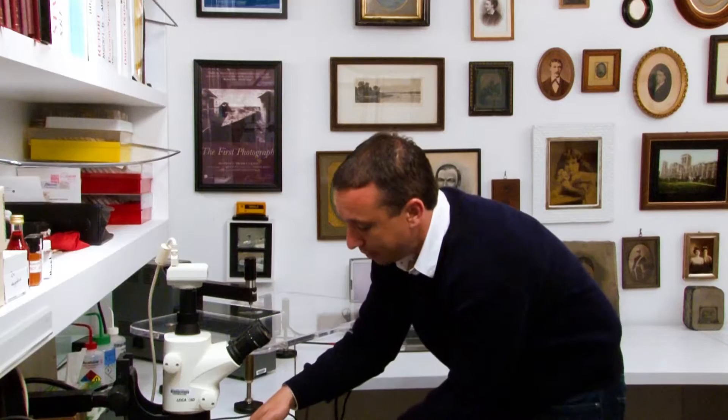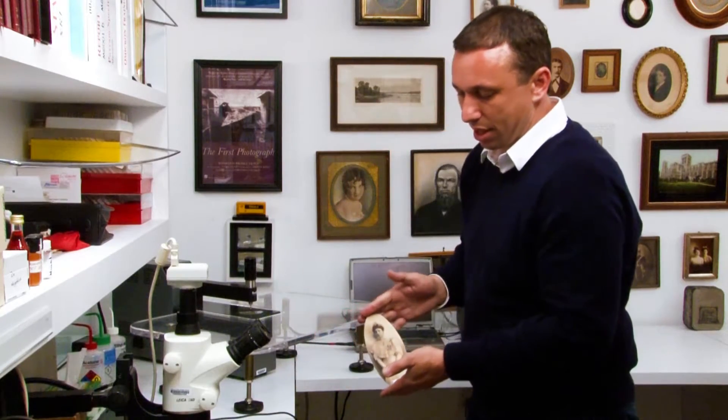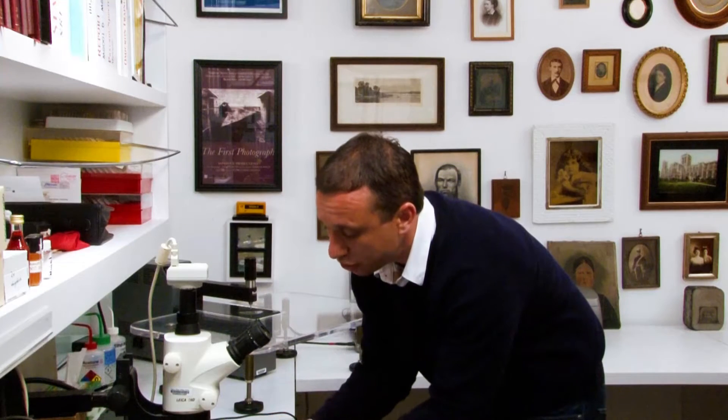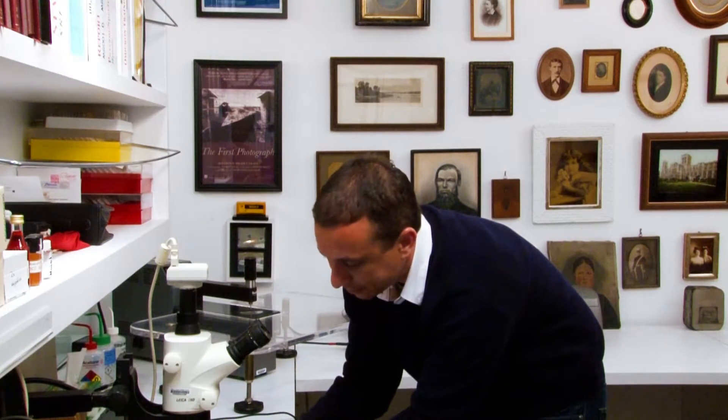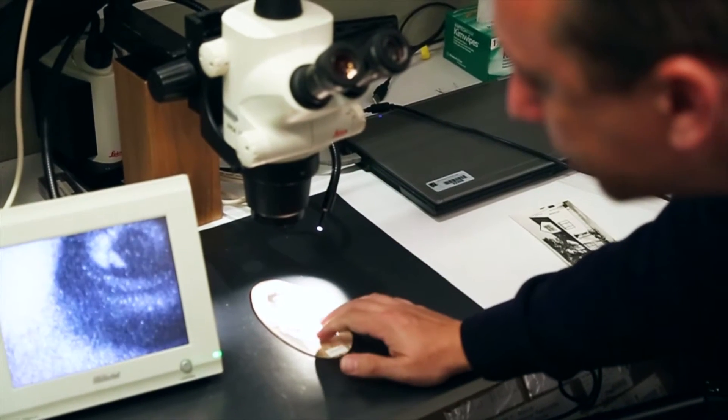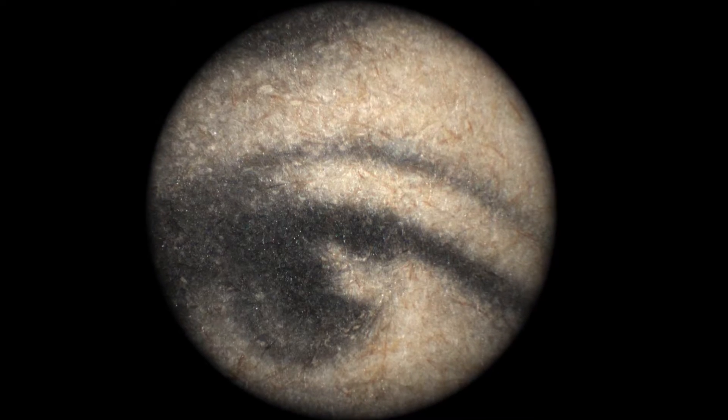This here is a platinum photograph. In the platinum photographic process, the image actually sits directly on the paper fibers. You can start to see the paper fibers themselves that the image is residing on, and especially if I zoom in a little closer, you can see that the actual fibers are dyed.